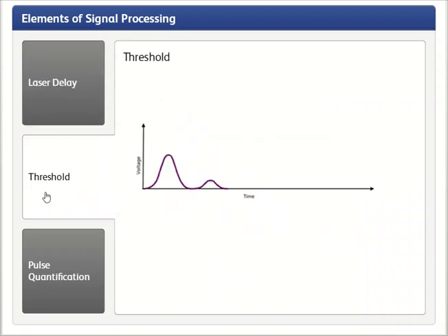Pulses are generated whenever particles pass through the laser. To avoid the collection of data on debris, a threshold can be applied. The threshold is the minimum pulse height for signals to be processed. When a pulse exceeds the threshold, signal processing on the pulse occurs. Signals below the threshold are not processed. No data is recorded for those events.